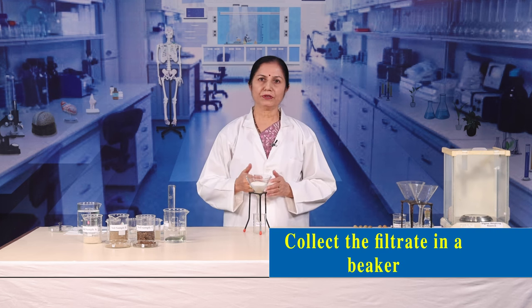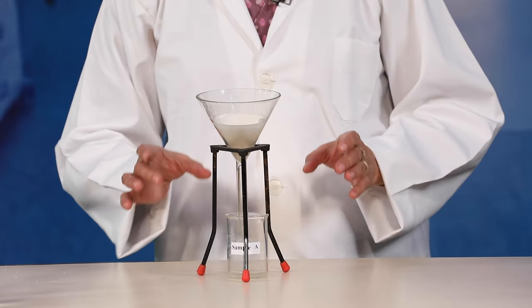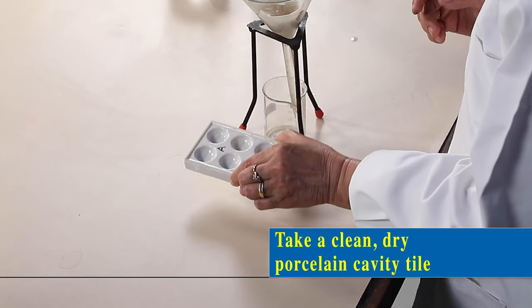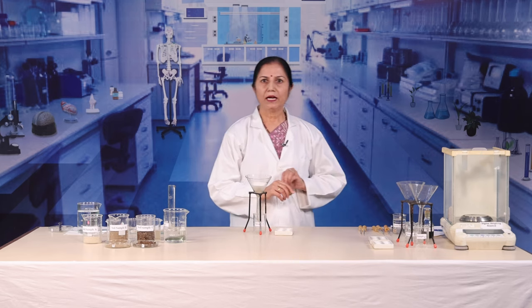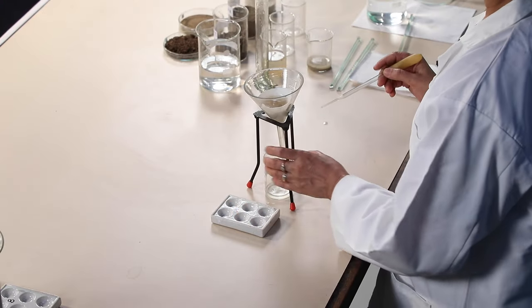Filter the soil solution through a filter paper and collect the filtrate in a beaker. Label it as sample A. Take a clean, dry porcelain cavity tile. Mark it as A. Place 5 drops of soil solution A in 3 cavities of the tile.